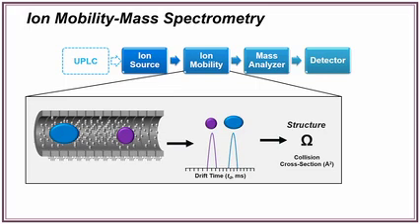And so in this particular case, these could be exactly the same mass to charge. They could be exactly the same mass, so same chemical formula, but because their shapes and sizes are different, they would have different drift times, and those would give us different collision cross-section values.